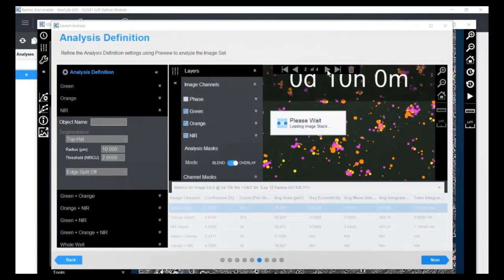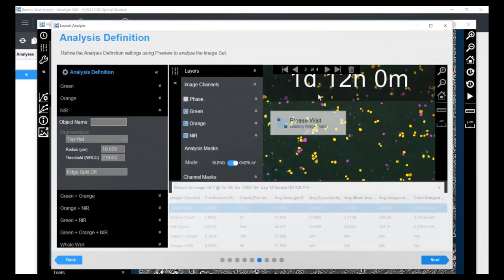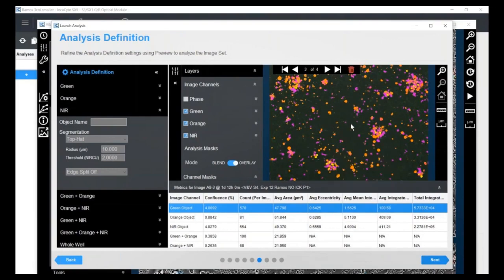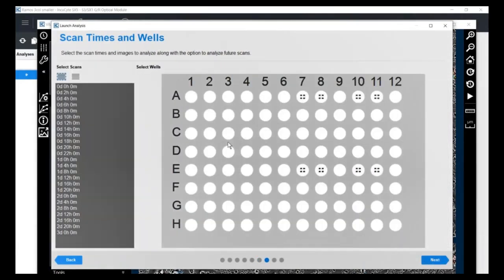So I'll check out here where we have no activation of our PBMC. We should have much fewer cells in green there. Here we're looking at our isotype control. Or actually, this is a later on time period, excuse me, of our activated PBMC. And I think these masks look satisfactory.